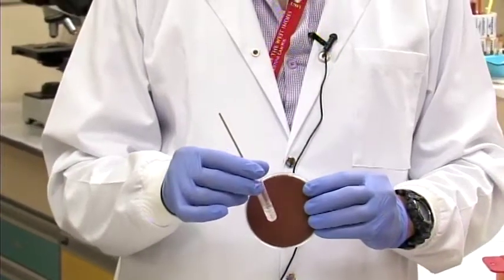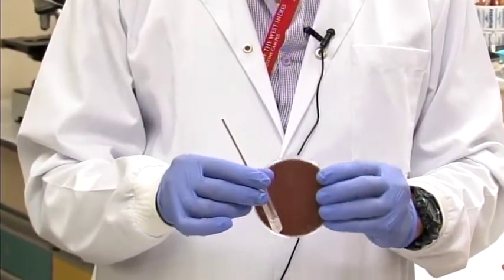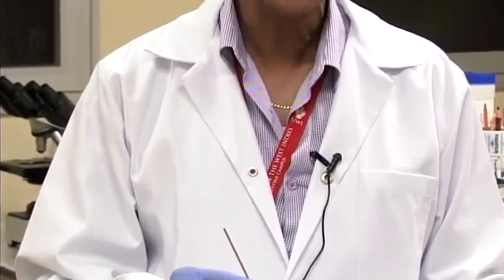So looking at the reaction for the catalase test, I have used an agar plate, just a colored plate, just as a background to show you the liberation of the bubbles for easier viewing during this video. So the previous reaction you saw was a positive catalase test using the bacteria Staphylococcus. Now we're going to use a negative reaction, using a member of the Streptococcus genus.